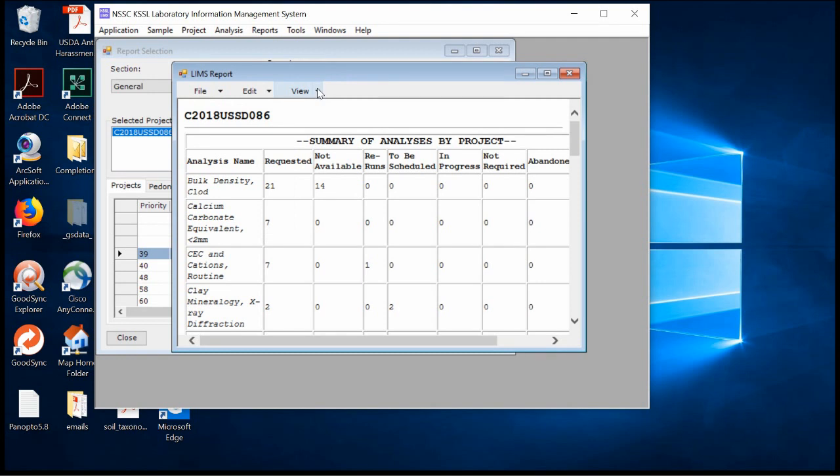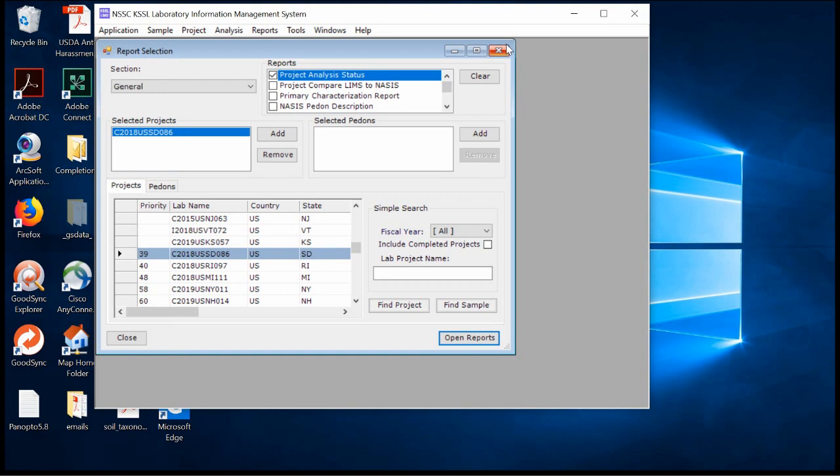And because it's a web browser, sometimes these reports may time out if you're asking it to do a lot of work, and it will show up in this window. If the timeout happens, what you should do is go ahead and immediately refresh it, because chances are it'll pick up and redo the report, and the next time not time out. Just a hint there. So that's really all I want to say about the report.